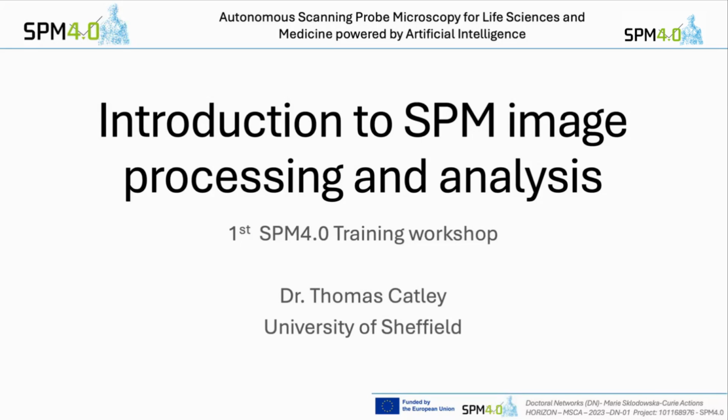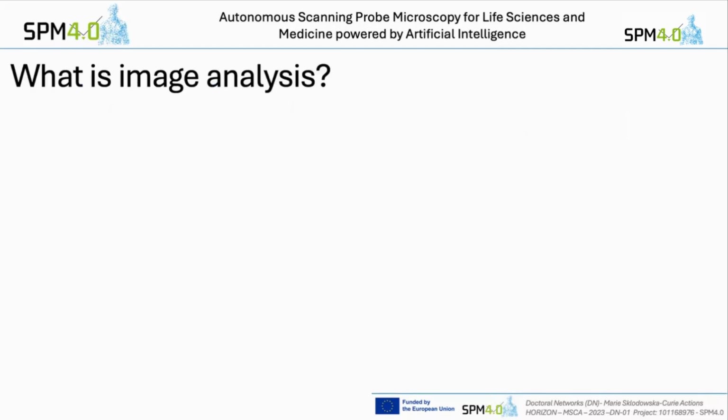The first hour or so, we'll do a bit of a talk about the various considerations that you need to have when you're processing SPM images. And then the second two hours is going to be a little bit more hands-on with Gwyddion, which I'm sure some of you will have heard of already, which is an AFM analysis software. And then a little bit of an introduction to automated image processing, which will be very useful for all of you, I'm sure. So let's get started.